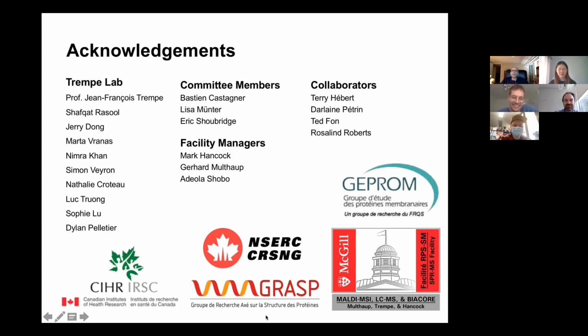So I have 2 questions. First of all, great job. First one's quite specific. Second one, I guess, is a little bit more general. So you talked about the in-gel analysis, and you said you didn't have to worry about detergents, but there's SDS there, and I just wonder what consideration you have to give to that.